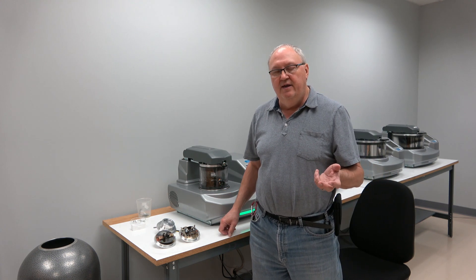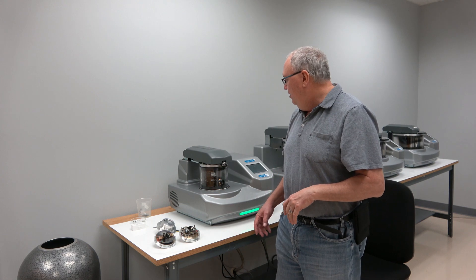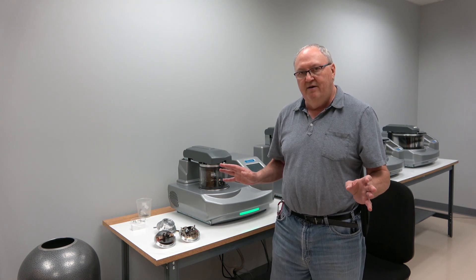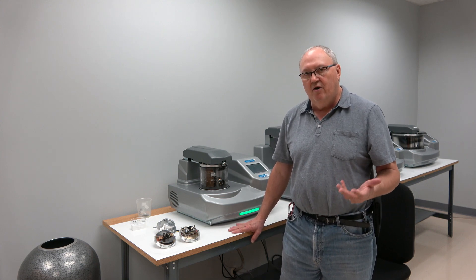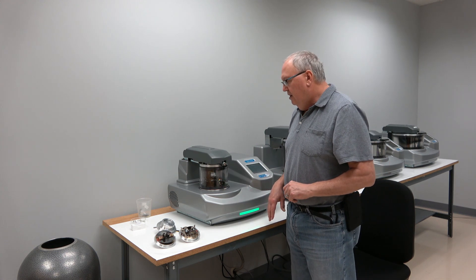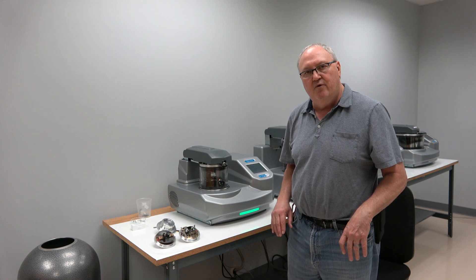There's a white paper I can send you if you're interested. I will put my contact information at the end. I can send you a publication which shows the difference in the materials chosen to sputter as well as how the quality of the vacuum determines the end product. Now let's talk a little bit more about the common features between them, totally independent of the vacuum system and its abilities — primarily these three inserts and how quickly you can go from one to the other. I'm going to start the system venting and come back; there's a separate video on YouTube which discusses the graphic user interface.